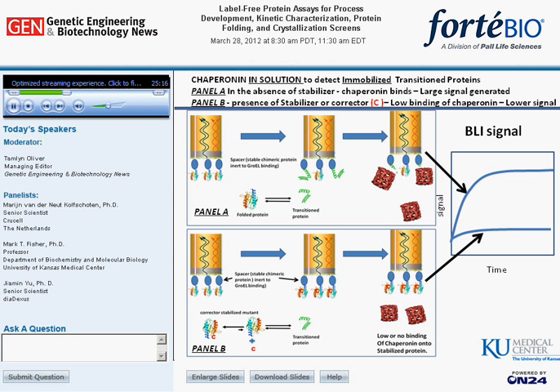We then dip these labeled tips into solutions containing first the lead compounds alone, and then move these tips to wells containing the chaperone and the same lead compound candidates. In panel A, if a ligand fails to stabilize the attached target protein, the chaperone binds and produces a large signal due to its large size, in this case 802 kilodaltons. In panel B, if a stabilizing ligand is present, the chaperone binding reaction is prevented or diminished, resulting in a significant decrease in signal. We can rule out false positives due to the chaperone inhibition by using internal controls using proteins that exist as partially folded conformers.